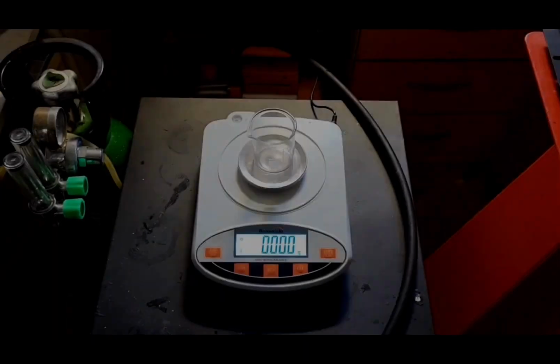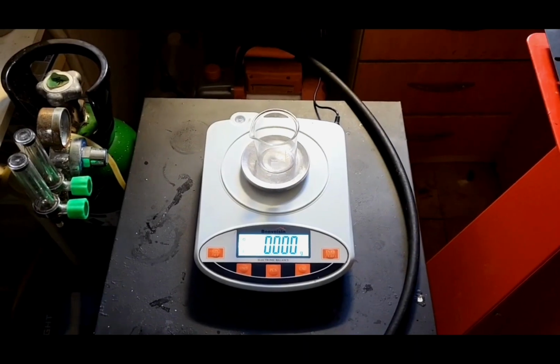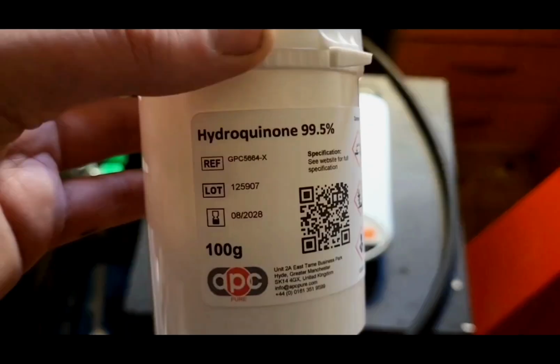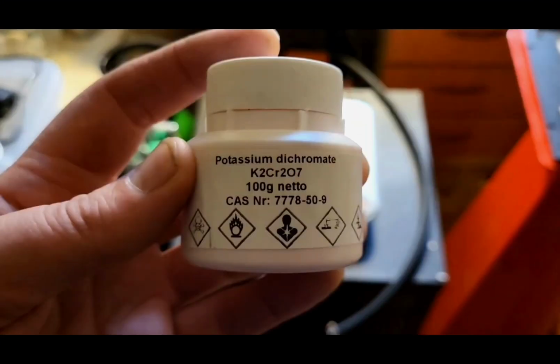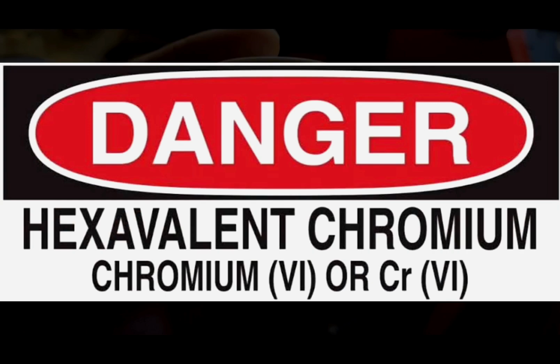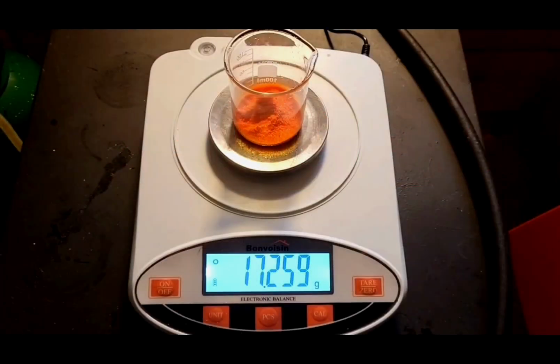Here we have made a dilute sulfuric acid by adding 9 ml of concentrated sulfuric acid to 130 ml of distilled water, for the acidic environment needed to oxidize 11.25 grams of hydroquinone using 17.25 grams of potassium dichromate. Be aware of its toxicity and how to manage the waste afterwards.